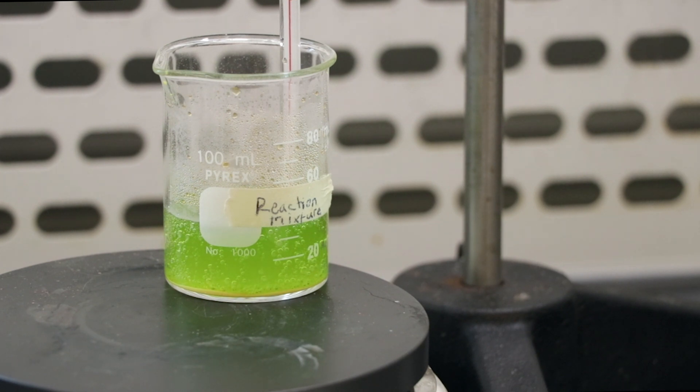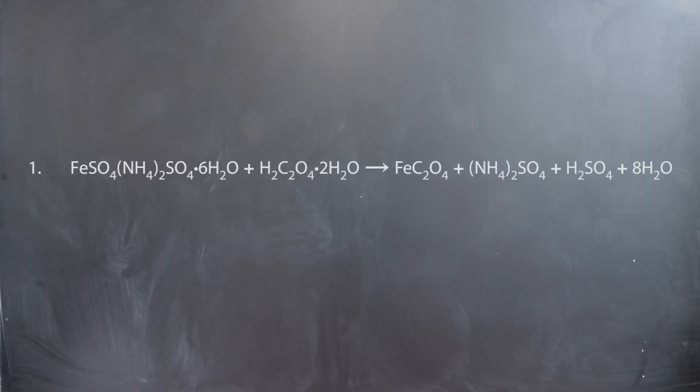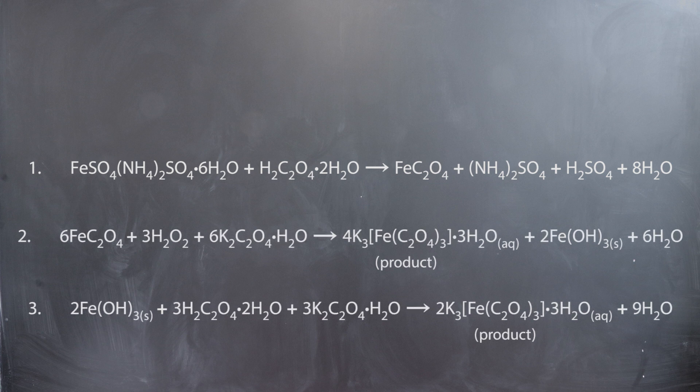During the entire operation, you should be keeping the solution on the hot plate at a gentle simmer. Congratulations! You have successfully synthesized your product. The brown precipitate that formed after adding the hydrogen peroxide is the ferric hydroxide, and the green solution represents the triaxalato ferrate ions. Now you need to recrystallize the triaxalato ferrate to form your potassium triaxalato ferrate trihydrate.